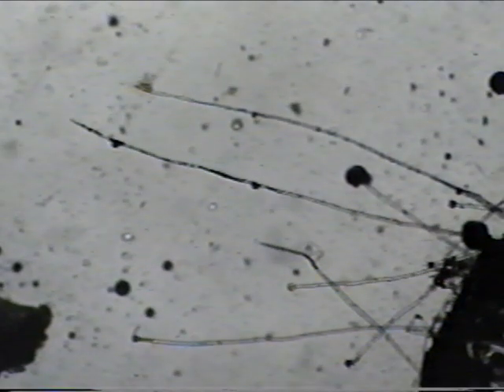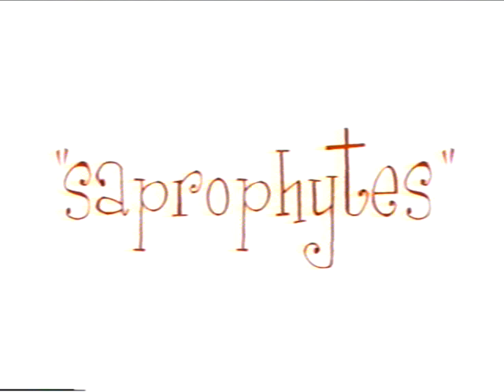When food in its area begins to run out, this mold will begin to grow long hyphae with sporocarps on them. The little black balls we see here are the sporocarps. The spores they release will ensure the survival of this fungus by being airborne, waterborne, or host-borne, seeds in effect. Most fungi are saprophytes. That is, they use carbon that is fixed or processed by other living things, but only after the other living things have died. This mold is an example of a saprophyte.